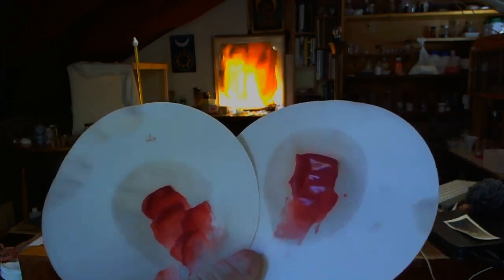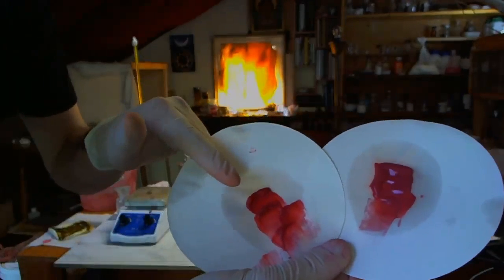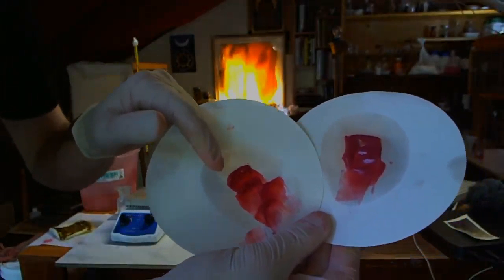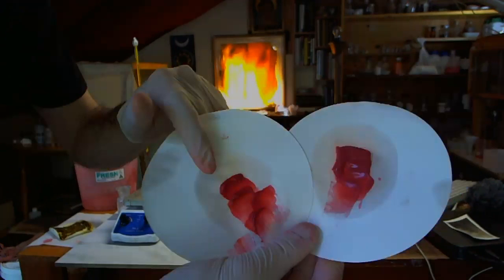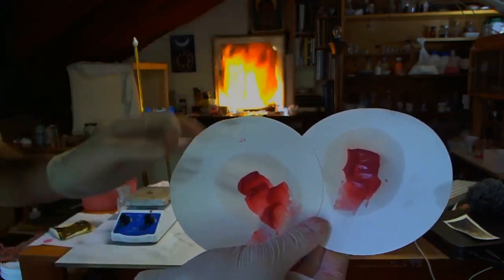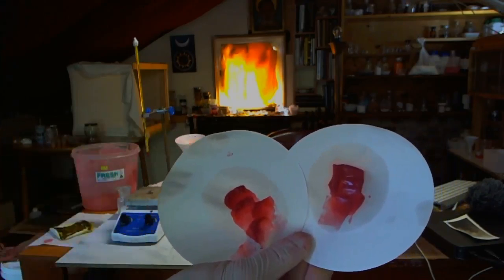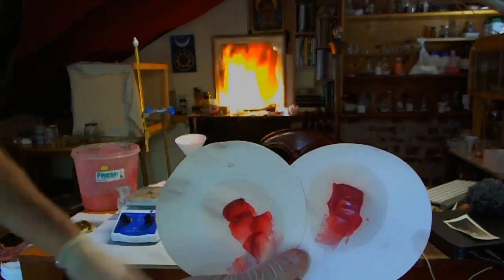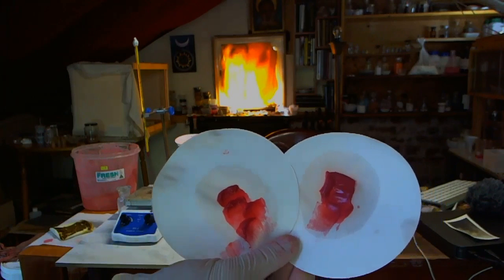And we're still filtering the first batch of just the regular stuff, but that extra purification step with the sodium sulfate and then the lead acetate definitely has resulted in a more vibrant, pure red color. So it's probably a cleaner alizarin with less impurities in it, as opposed to this one, which has more impurities in it. So that's a success for me.